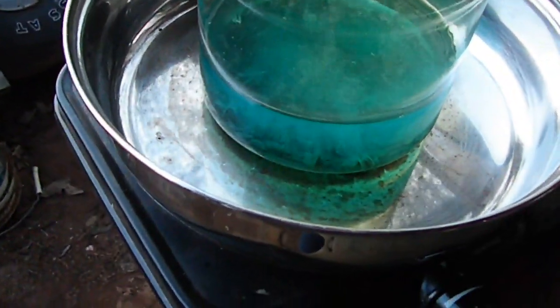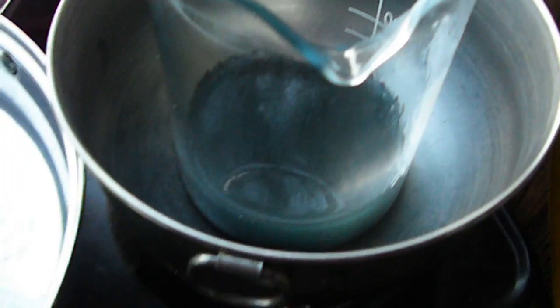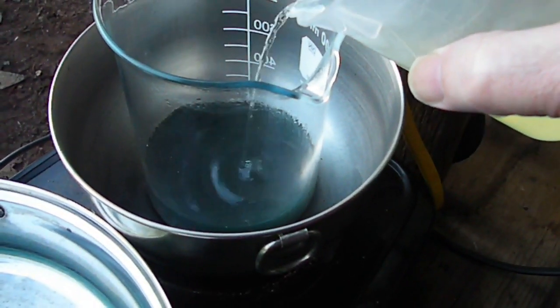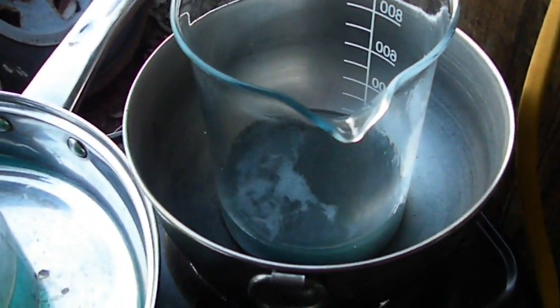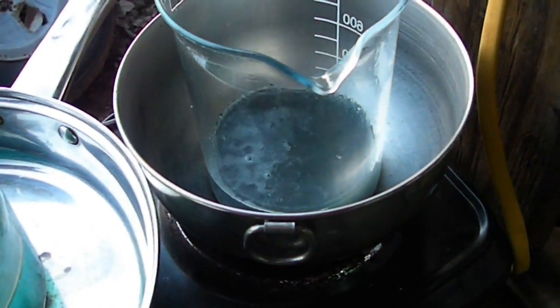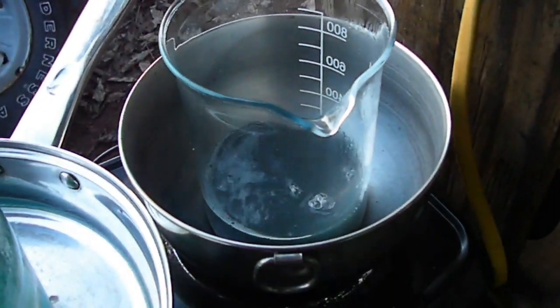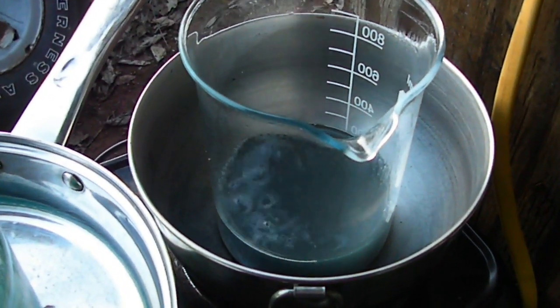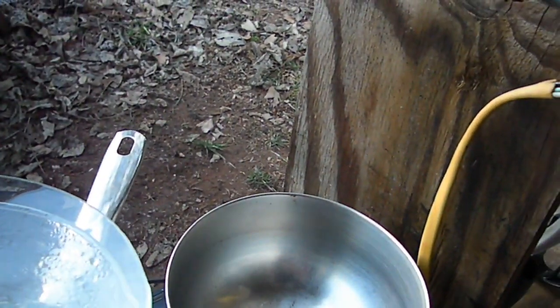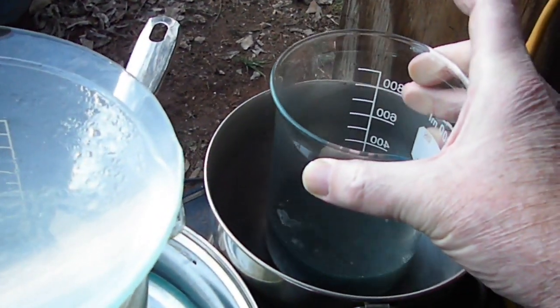Okay guys, another hour has passed. This one has actually settled down a little bit. We're still getting a good reaction. I just swirled that one up and it kicked off the reaction a little bit. So I'm going to go ahead and put a little bit more nitric in this one. It is starting to get really cold out here. See, that kicked it up, so we know we still have some active material in there. I'm going to put a little bit more distilled water in there, just in case, just a little bit. Give that silver somewhere to go. Swirl that one up again. Got a lot of residue powder in the bottom of this one. So we'll swirl that one up.